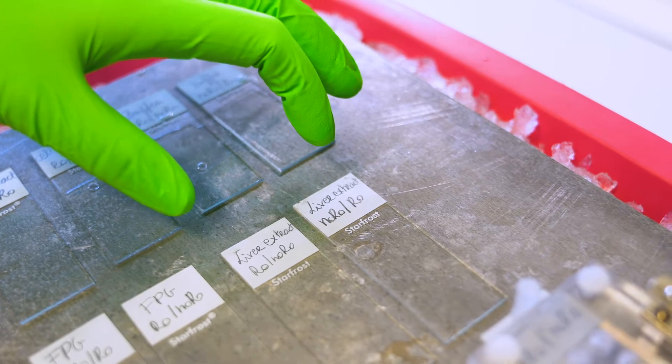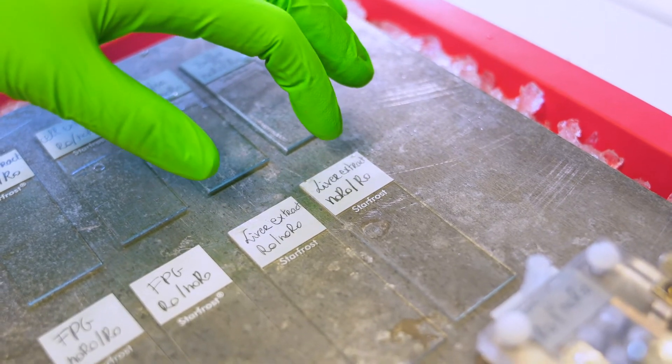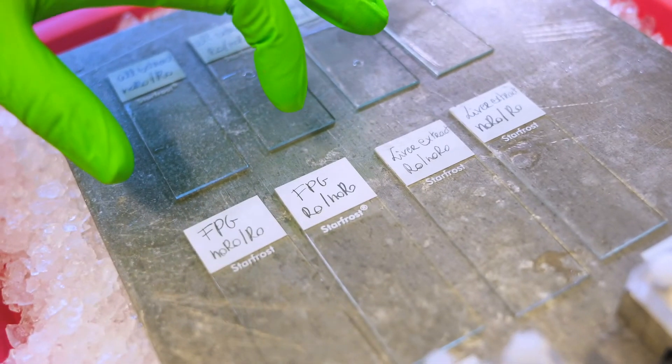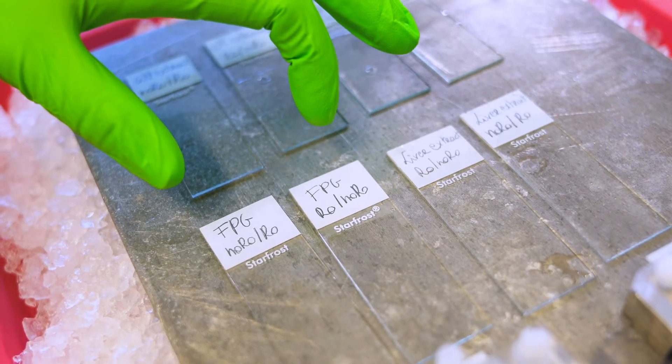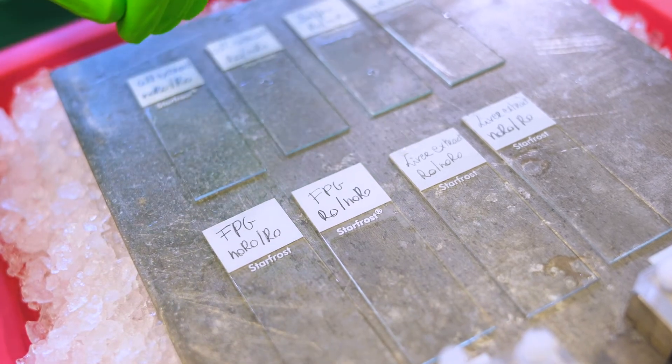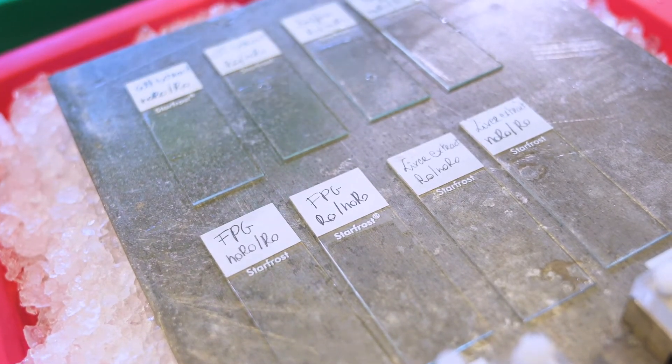Or you could work with tissue extracts. In our case we're using a liver extract. Important is that you always include an assay control. Since we're working for BER with compound-exposed cells, we use FPG as an assay control to see if the assay worked.